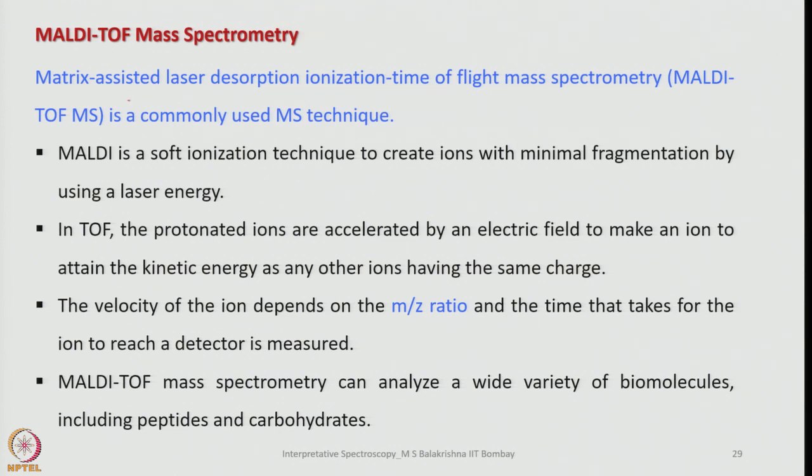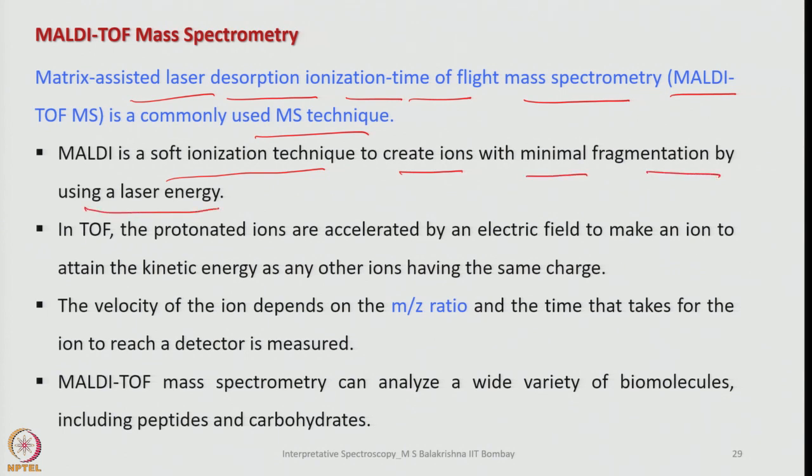That means matrix-assisted laser desorption ionization time of flight mass spectrometry, quite lengthy, but it is abbreviated as MALDI-TOF MS. And this is a commonly used MS technique. MALDI is a soft ionization technique, unlike EI, to create ions with minimal fragmentation by using laser energy.